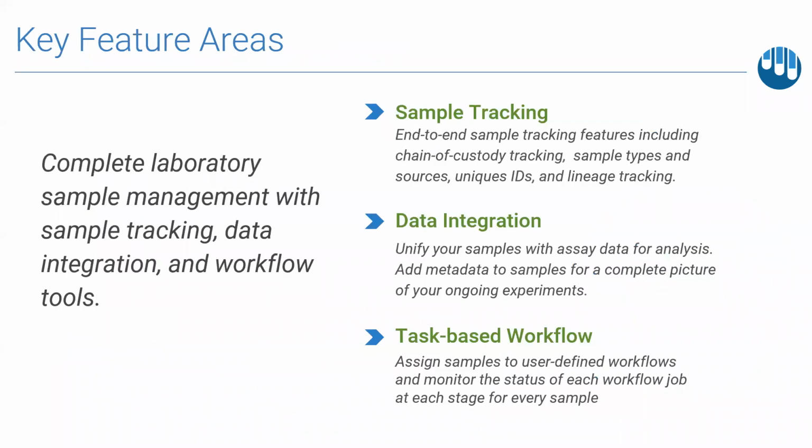When we think about LabKey Sample Manager, there are really three key areas which stand out and make it unique in many ways. Firstly, there's the sample tracking, of course, where we'll be spending most of our time today, and I'll go into that in a bit more detail in the next slide.